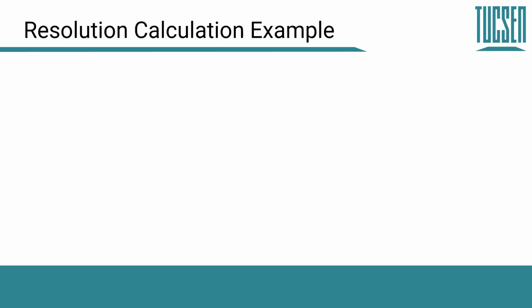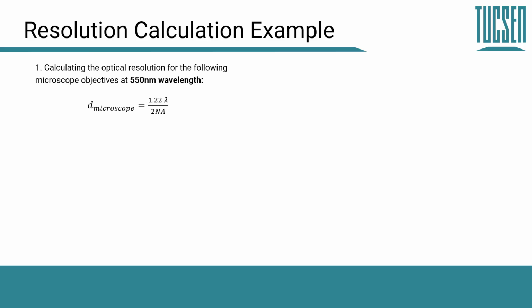So how do we go about using these resolution calculations and matching things up with our microscope objectives and camera pixel sizes in the real world? Let's have a look at some examples of that.